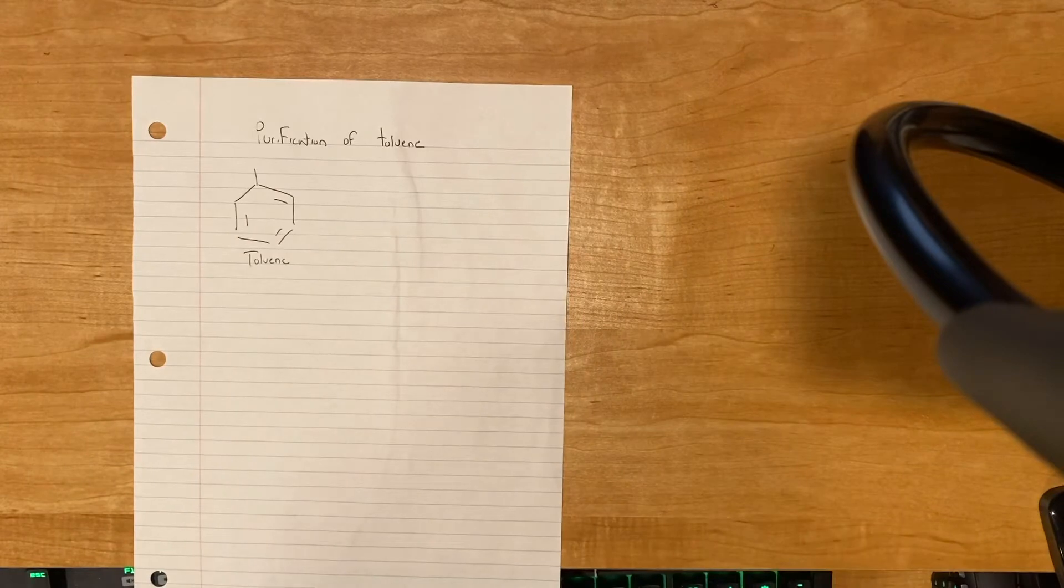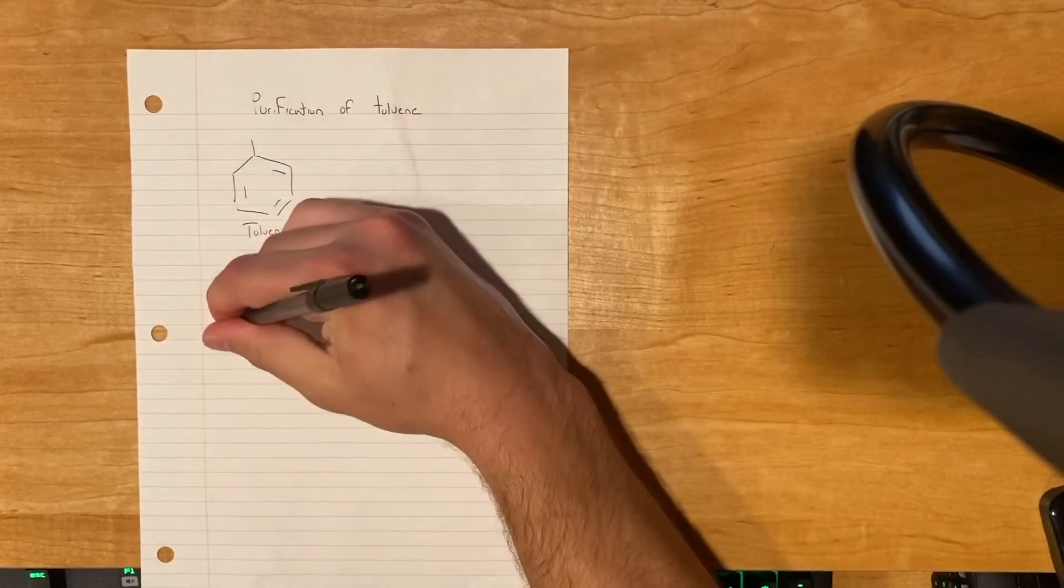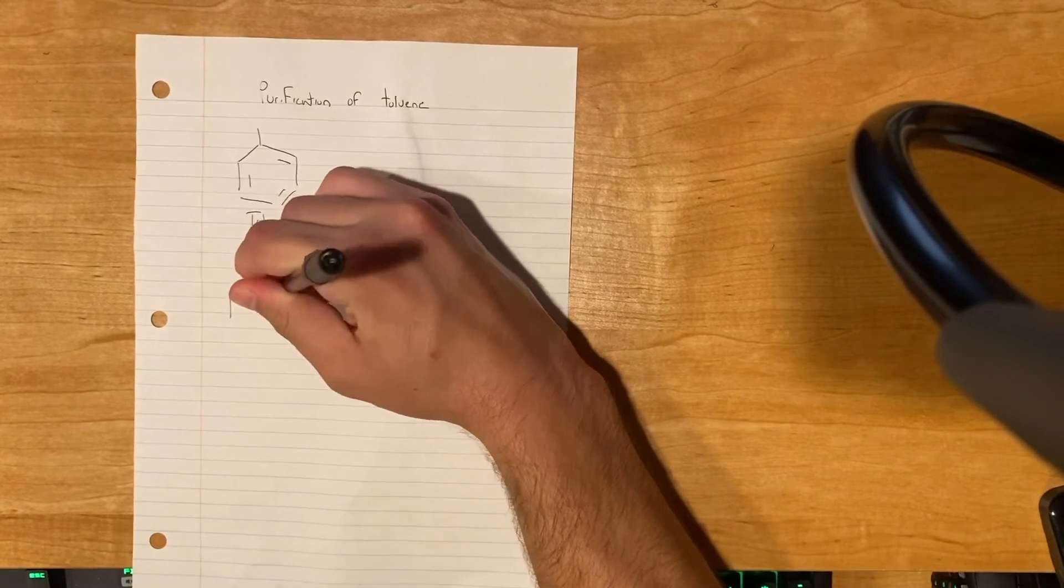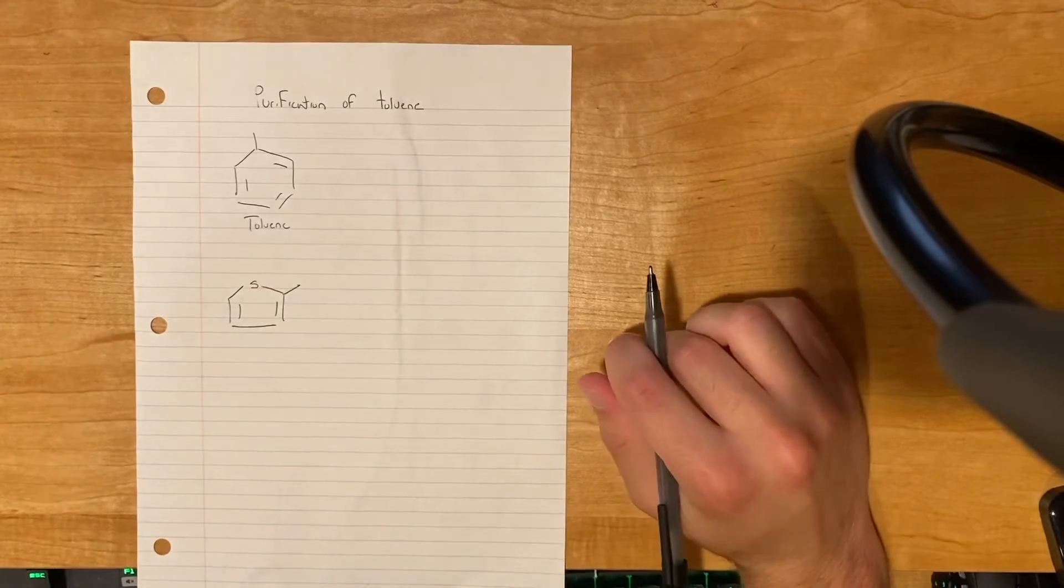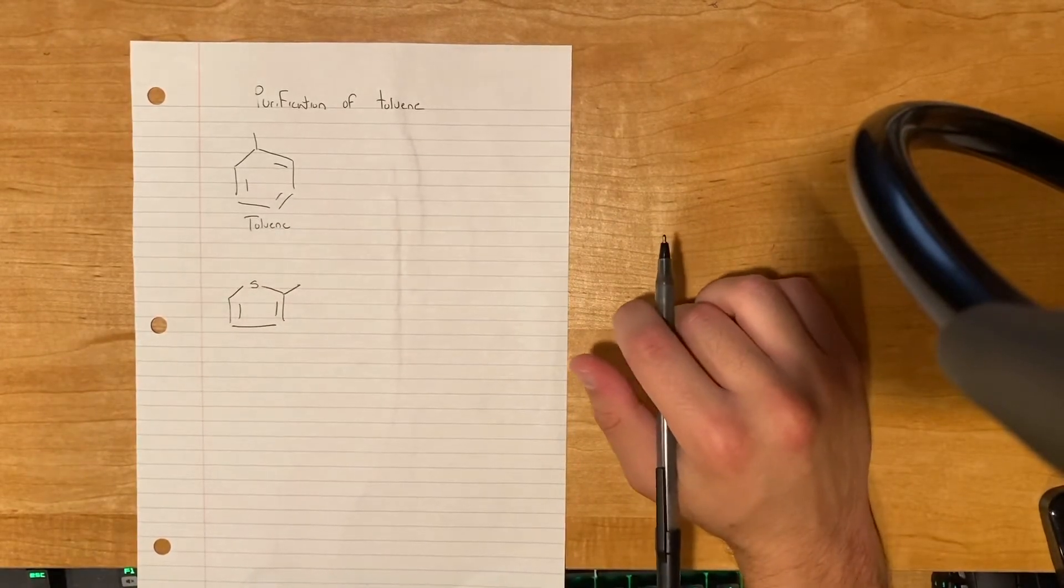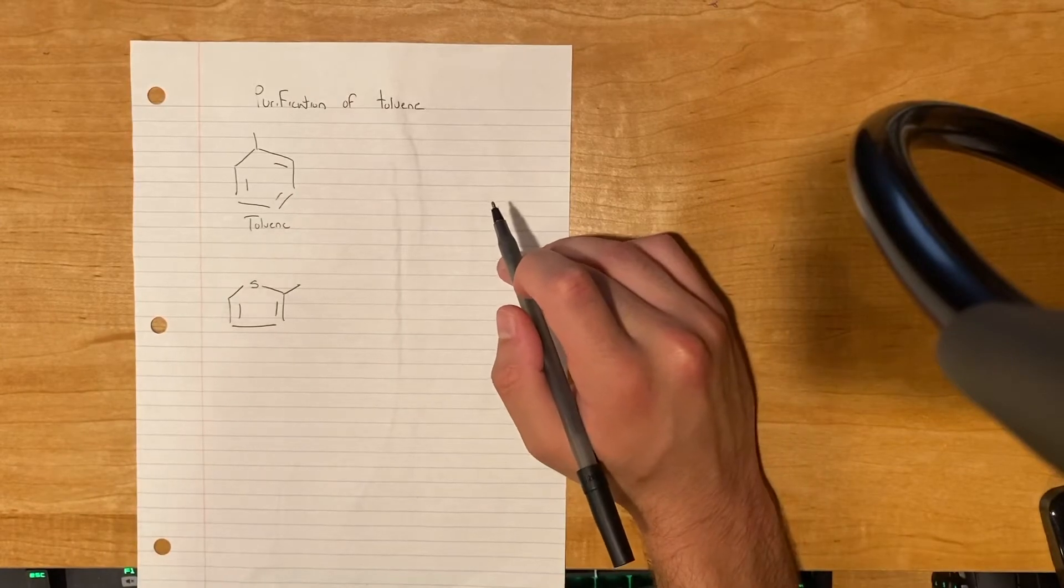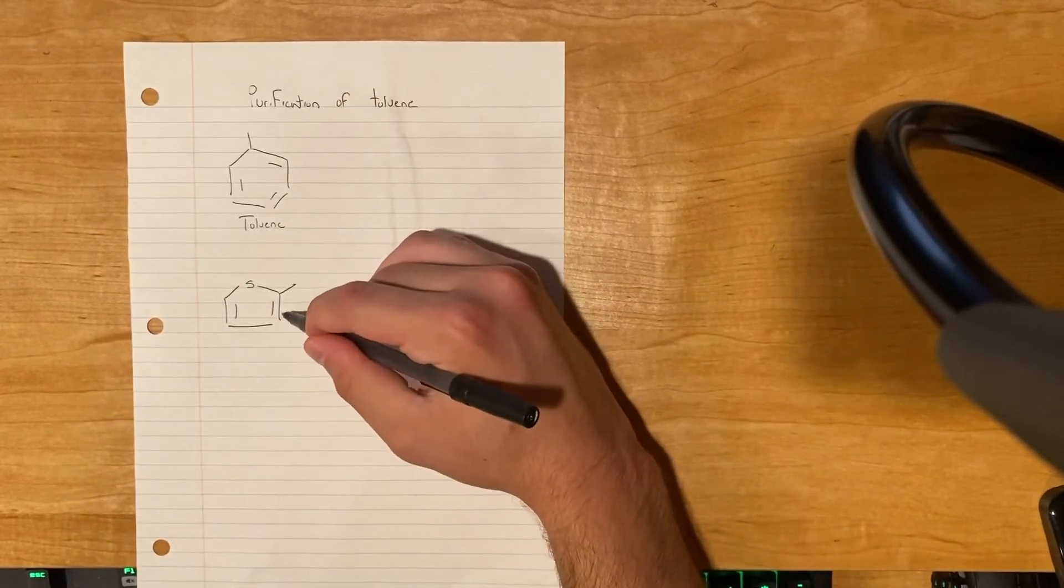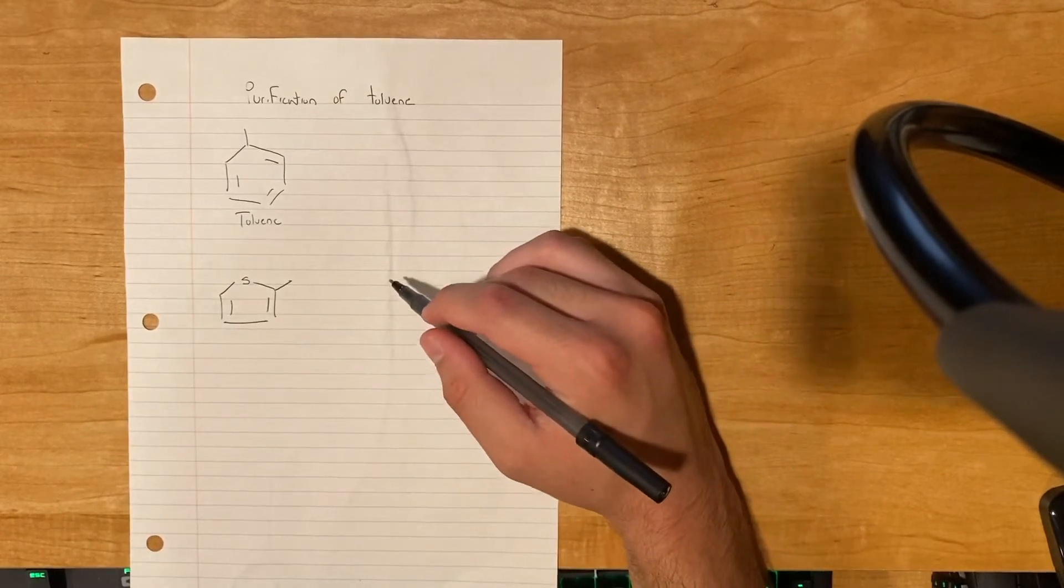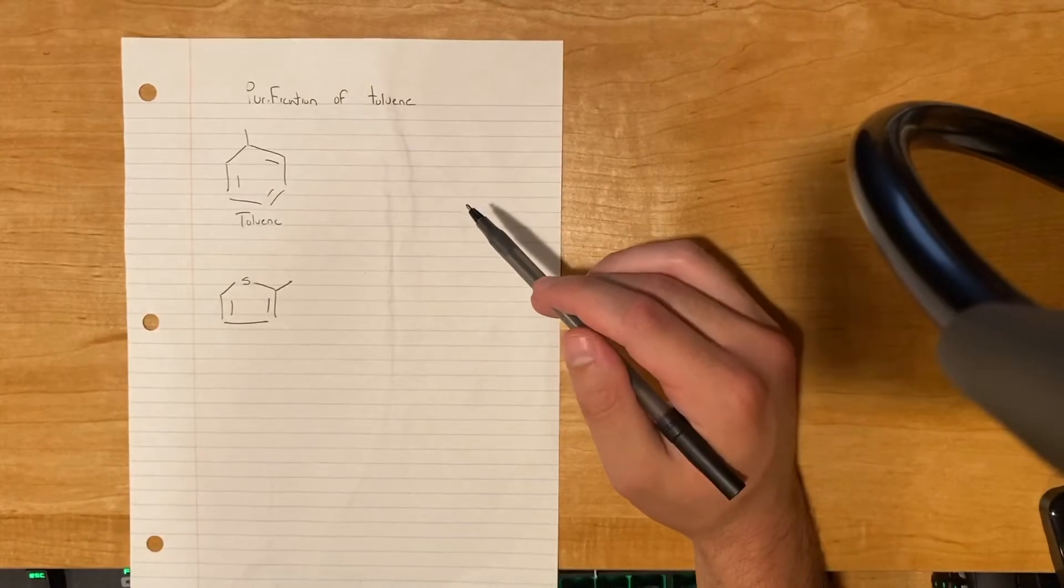Toluene needs to be purified because it contains an impurity called methylthiophene, as seen here. Methylthiophene and toluene are both aromatic compounds, but when toluene undergoes electrophilic aromatic substitution reactions, if methylthiophene is present, it can polymerize and cause your end product that you're trying to get to become contaminated.